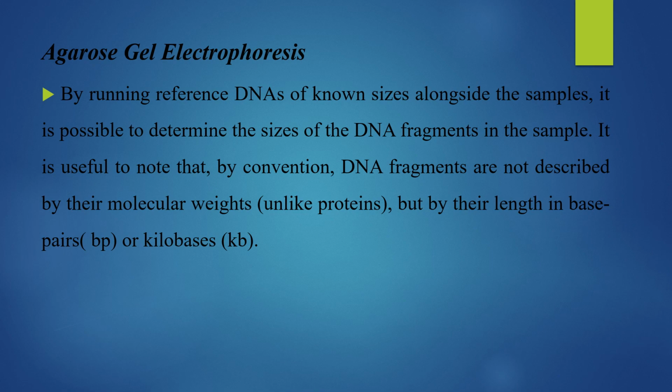Now, by running reference DNAs of known sizes alongside the samples, it is possible to determine the size of the DNA fragments in the sample. So just like the control you use for HB electrophoresis, something should indicate to you which ones you have identified. It is useful to know that by convention, DNA fragments are not described by their molecular weights, unlike proteins, but by their length in base pairs or kilo base pairs.